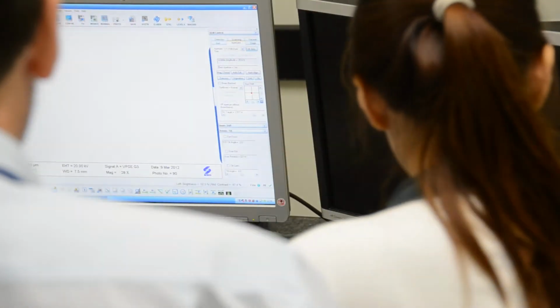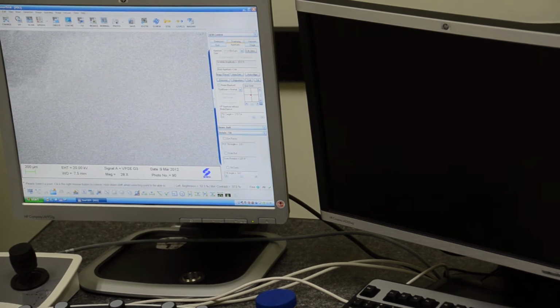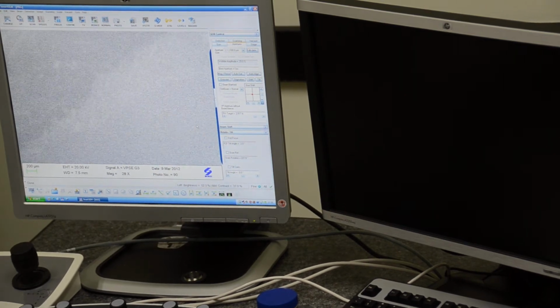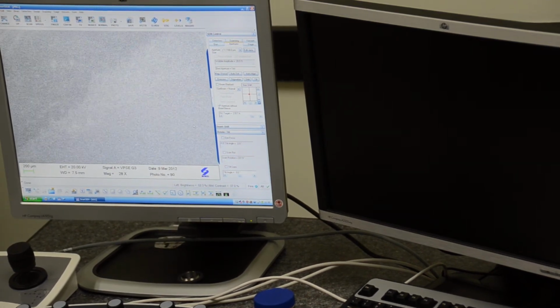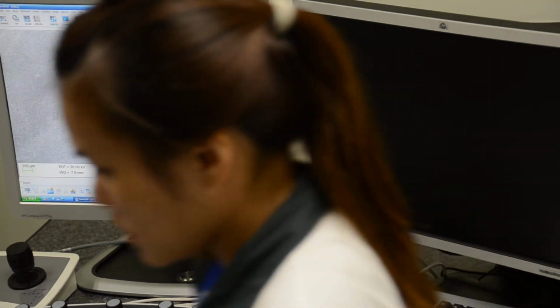Yeah, you have to remember, otherwise you don't see anything, because with too small an aperture, they can't really align it. Here we go, it's about 9 or 9.1. But you don't really need to care too much about that. You just see it right. That's all. It's about around 9.